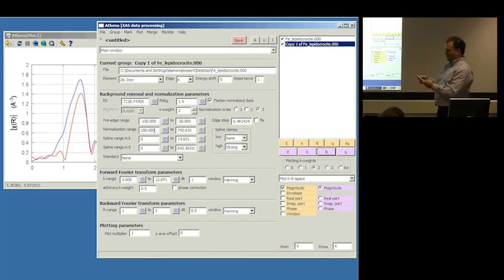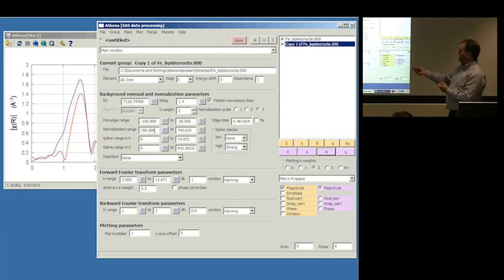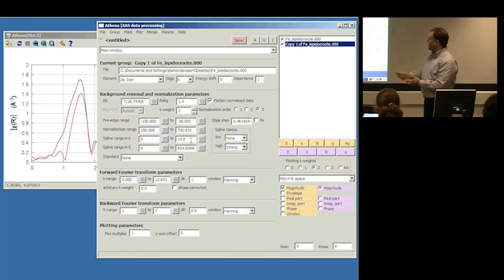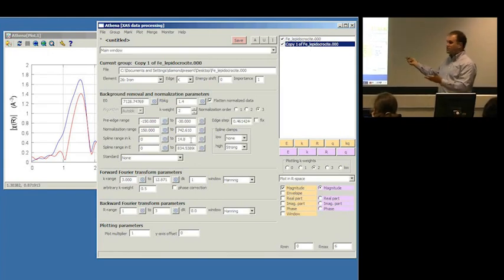And the solution is to change either that number or that number. These two lines are not independent. Right? 14.8 is 842 volts above the edge, and when you change the one number, the other will change. I'll demonstrate that actually, if I see how, as I change the value in k, the value in E changed along with it.